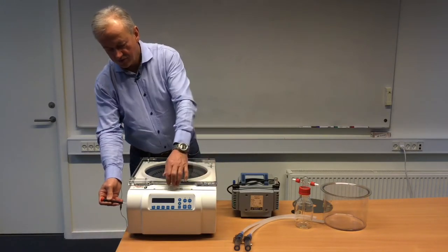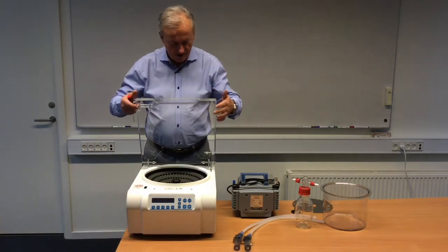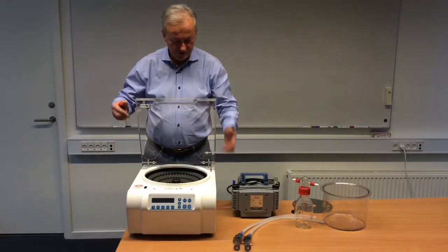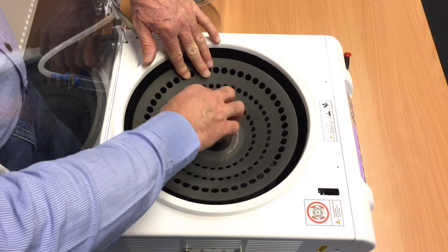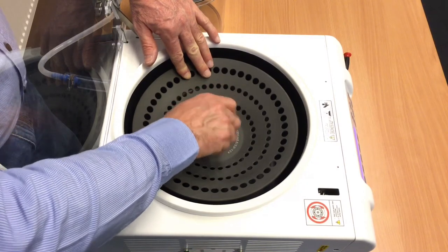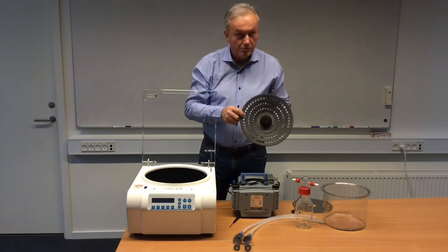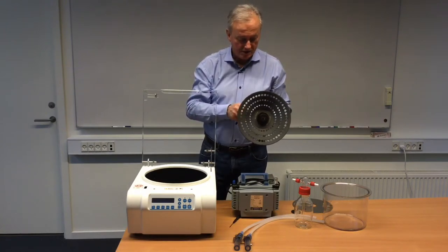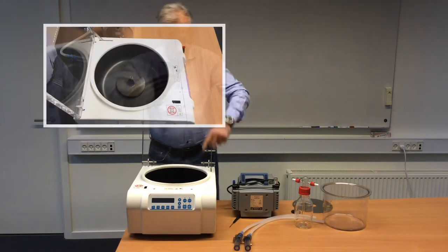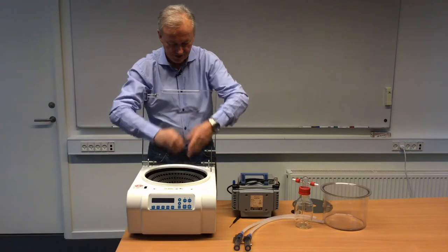Simply open the safety lock at the back, you can open the lid, and now it will not go down again because of the safety here. Inside we have a rotor as standard. This rotor is for 2.0 ml and 1.5 ml Eppendorf tubes. Inside we also have a Teflon coating, so the ScanSpeed is resistant to virtually anything.